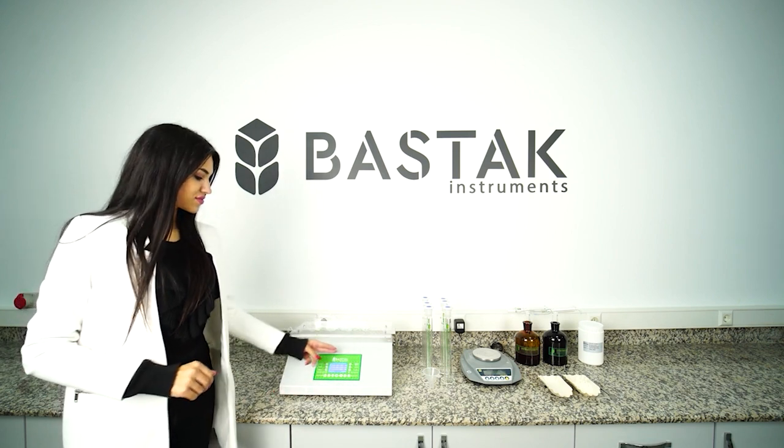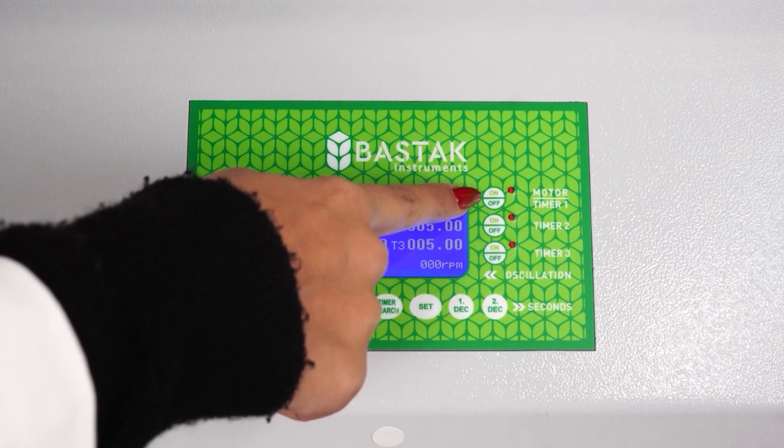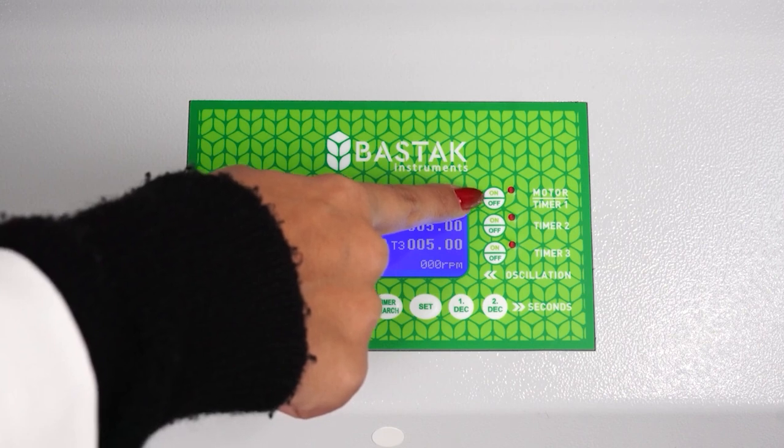On the control panel of the device, there are buttons. Motor timer 1 is used to start and stop the shaking process of the sample during analysis. It activates both the timer and the shaking motor, initiating the shaking process.